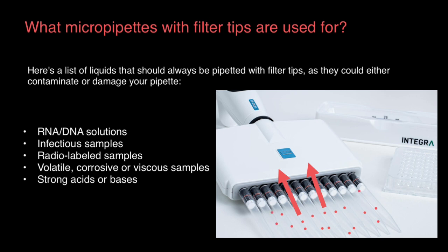It's particularly important to use filter pipette tips when handling liquids that could damage your pipette, such as radio-labeled or corrosive samples, for both your own safety and the lifetime of your pipette.